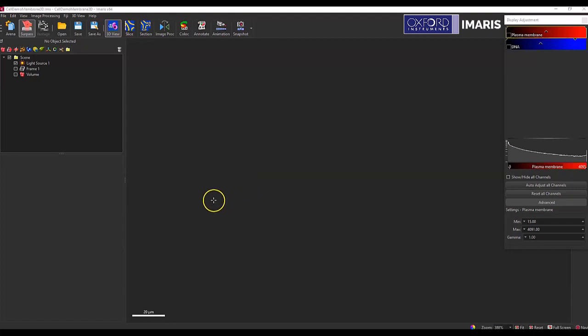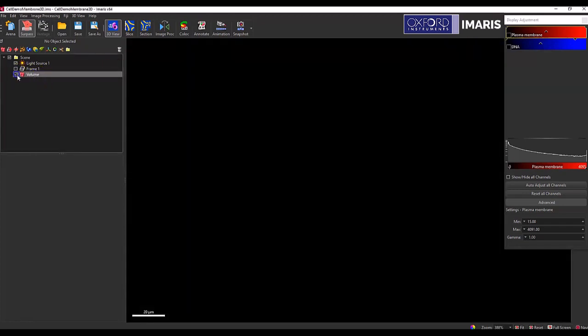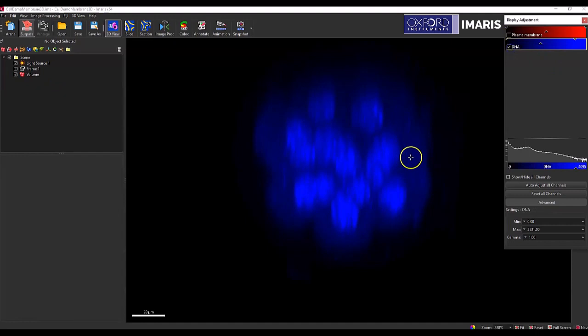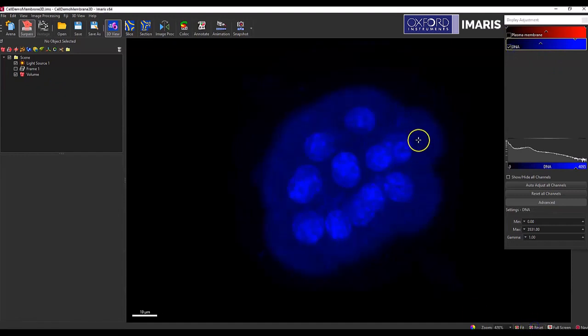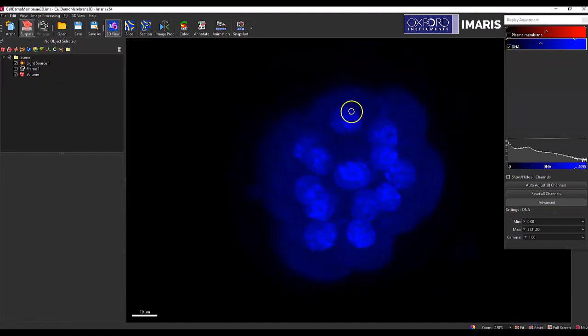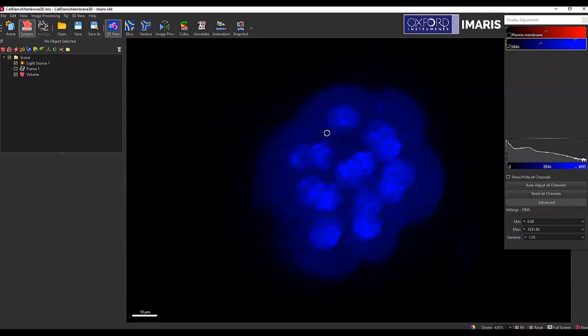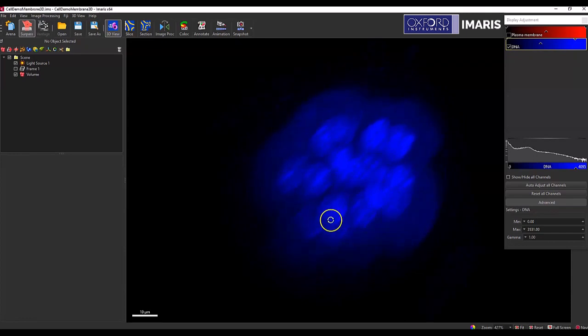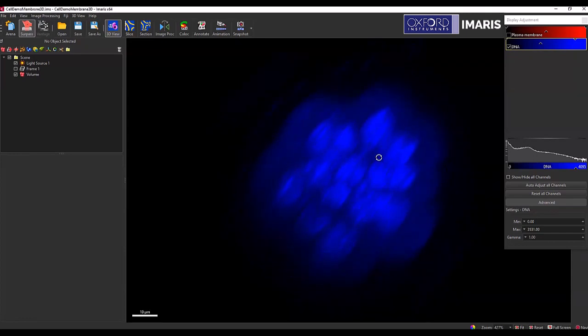Hi, today I'm going to show you how to dilate a surface object using distance transformation. First I will turn on just my fluorescent signal so you can see what we're working with. I'm going to base my surface objects on just this simple nuclear staining here.